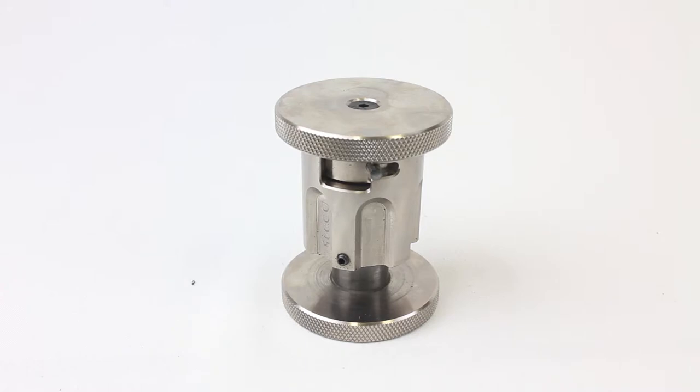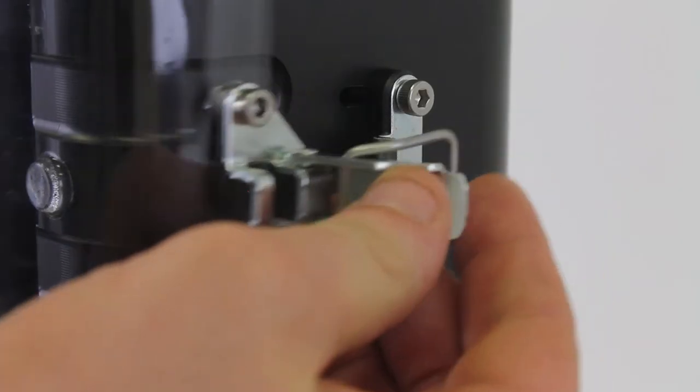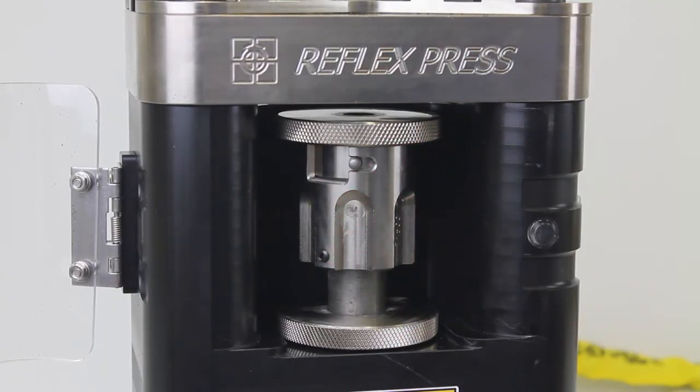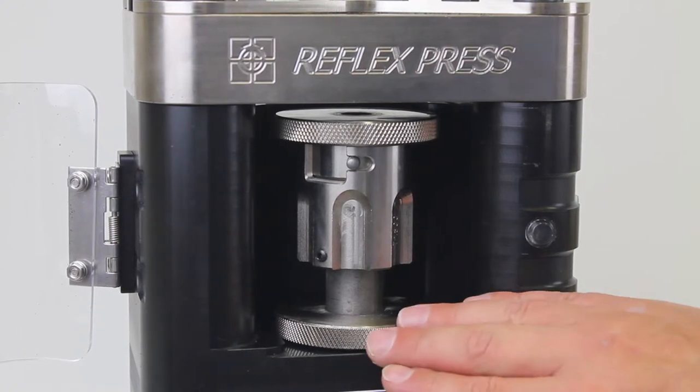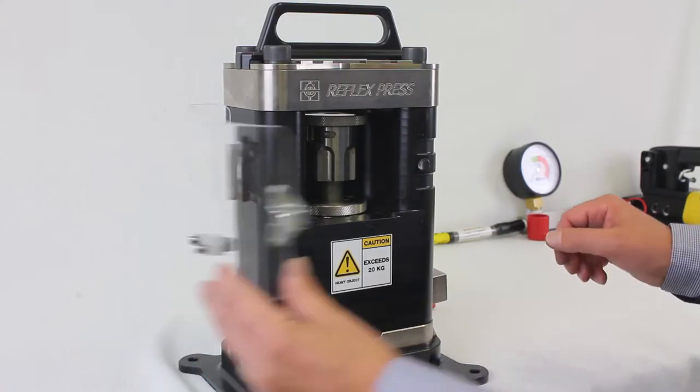The sample is now ready to be pressed. The press uses hydraulic pressure to press the sample and operates at high pressures. When pressurized, do not touch any hoses or fittings. Unlatch the door to the press and place the sample die into the press. Insert the die fully utilizing the provided guides. Close and latch the door.